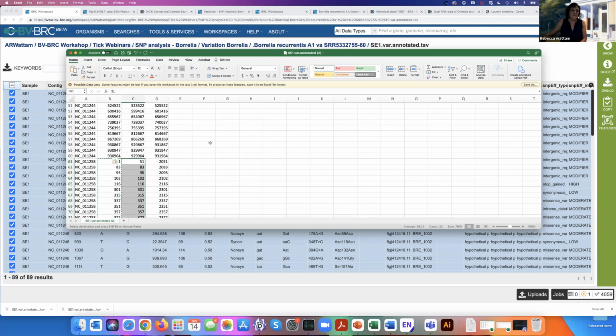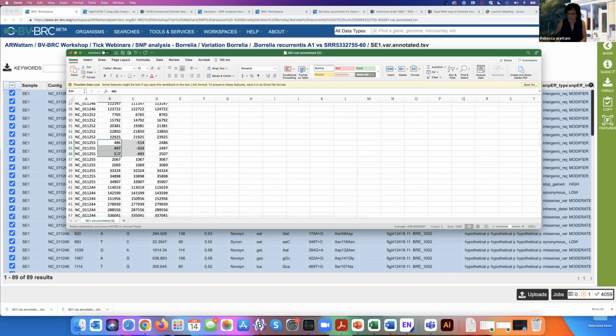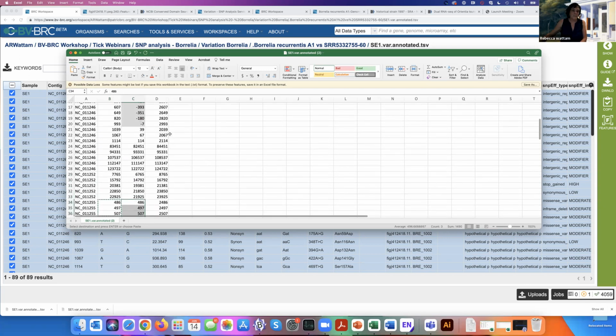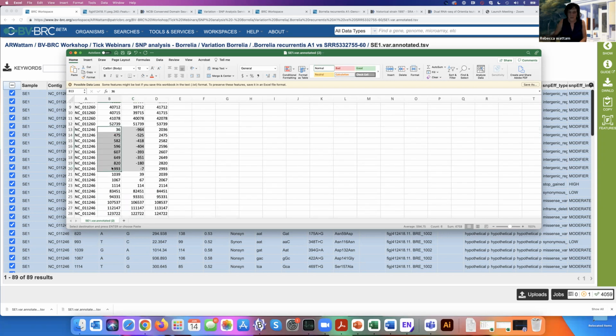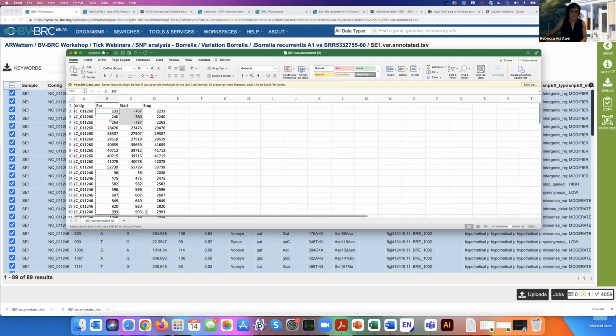This is the view that I would use if I wanted to put it into a publication. So I'm putting the start code on here so it knows where the start site is. I apologize for this, but the downstream thing is really nice.